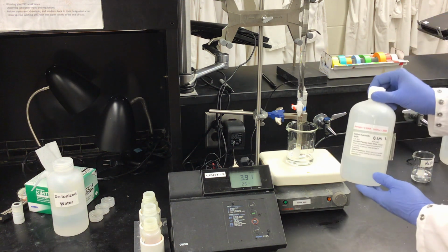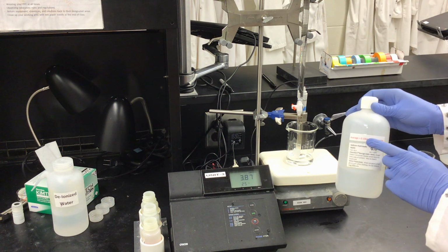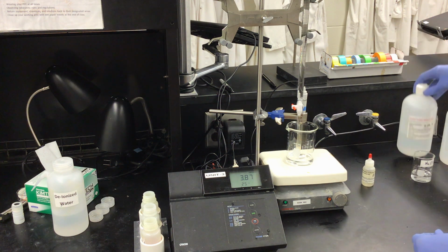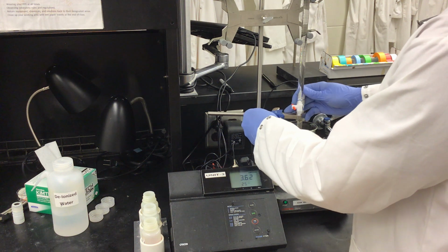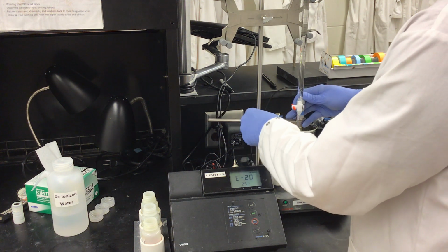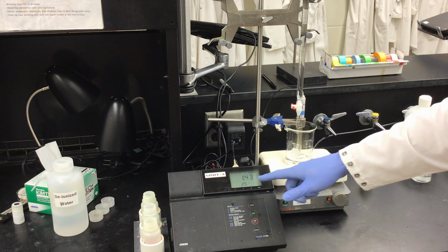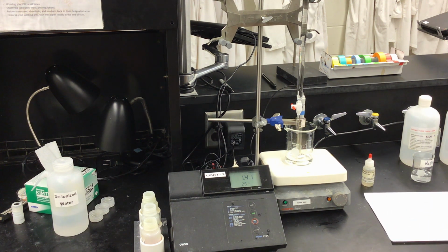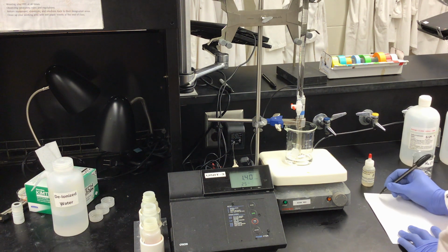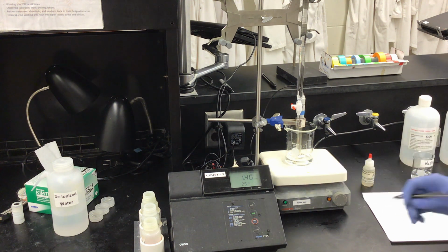We have standardized sodium hydroxide in our burette, which means that we know exactly how many moles of sodium hydroxide we are going to be adding to our solution just by watching the volume. And then as we go, we will need to be taking pH measurements the entire time. So I'm going to get an initial pH measurement by sticking my probe down into my solution. As you can see, I have a pH of 1.42, so I will need to take and record my pH. So our initial pH at 0 milliliters added is 1.40. We can read that because our pH meter reads ready at 1.40.